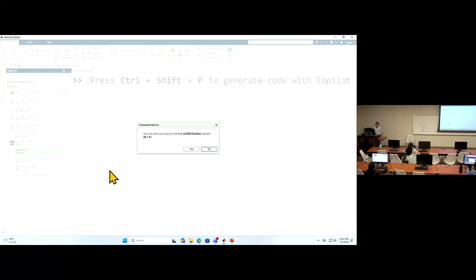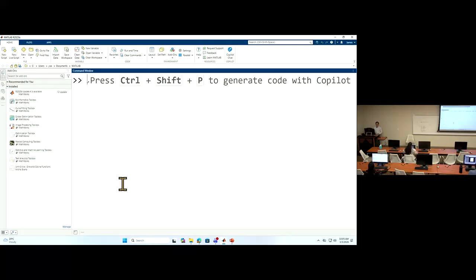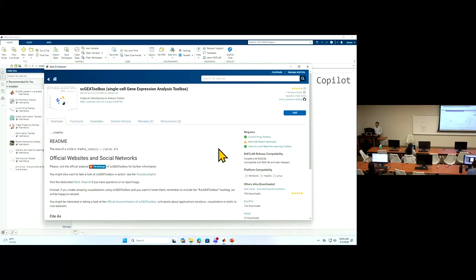Old version first. Okay, if you have difficulty finding the place where you found the toolbox, you can uninstall the old version. If you don't know, let me know. Then from here, you should have this clean and ready to upgrade to version 26.2.